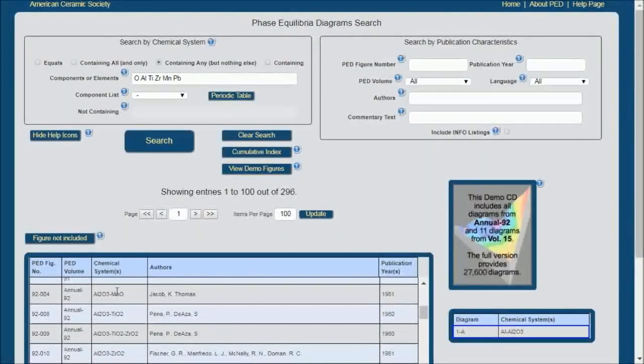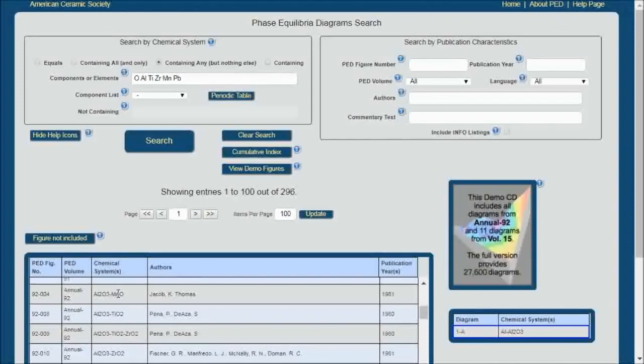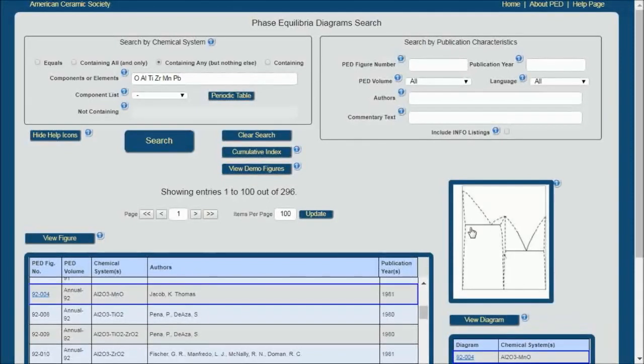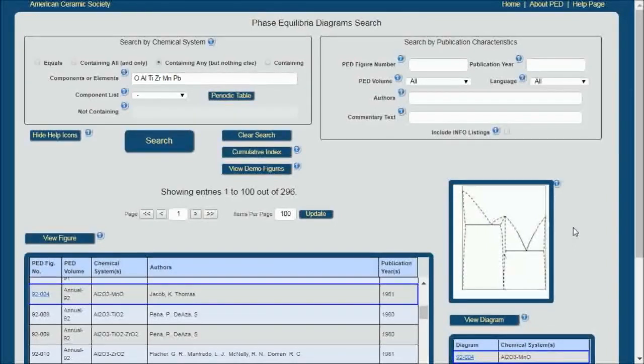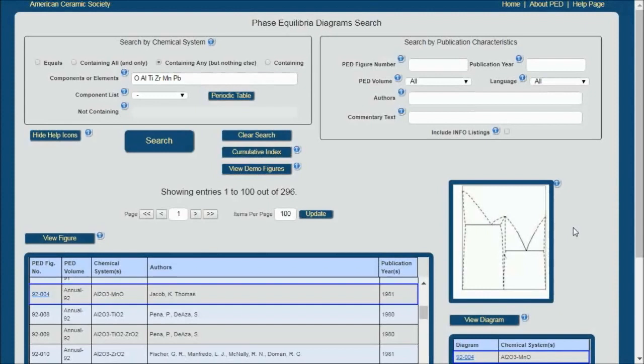I will pick this alumina manganese oxide system, and you'll see in this window here a preview. And in Part 2, you'll see where that preview becomes quite useful.